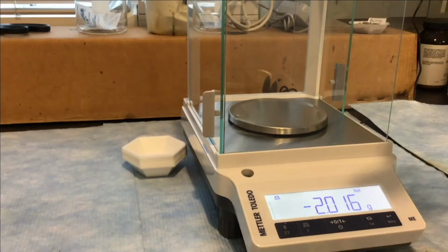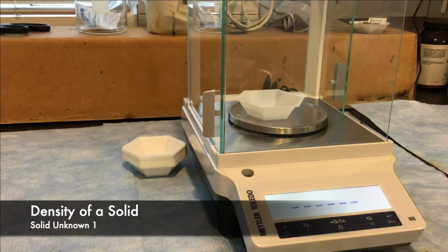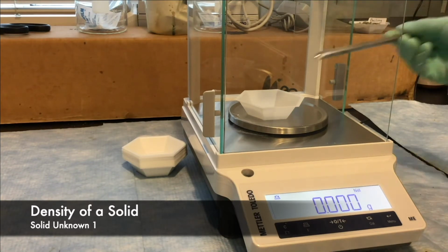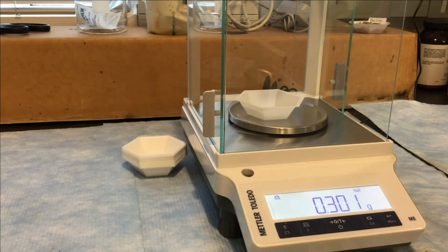Moving on to Part B, we're going to find the density of our unknown solid and our unknown liquid. With our weigh boat on our balance plate, we're going to tare or zero our balance. And then we're going to slowly and carefully weigh out 1.5 grams and record the mass.